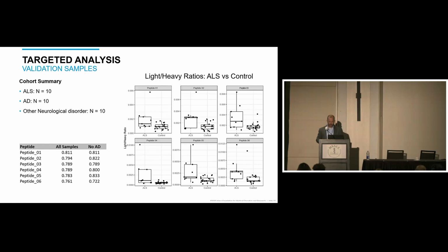So we had a total of 20 controls, 10 cases, AUCs. 4 peptides were validated with an AUC of greater than 0.8. This isn't exactly what I was hoping to see. Although it's definitely a step in the right direction. I think what I had done is potentially shot myself in the foot because I added so many more targets to the list before I did this analysis. We weren't really scanning these as long as we should have, so we weren't filling as much. I think we can improve on this a lot.